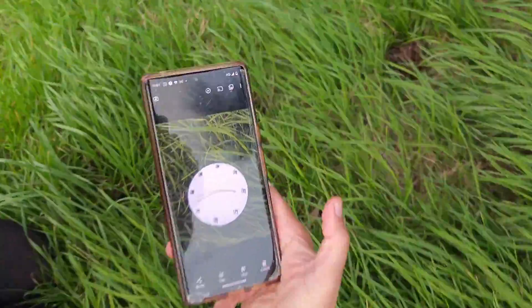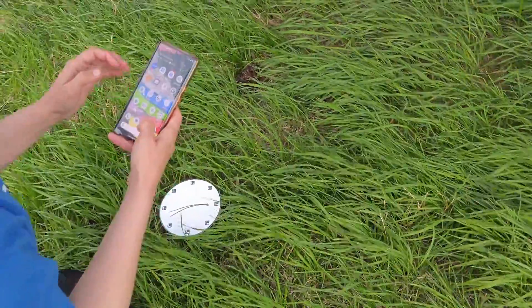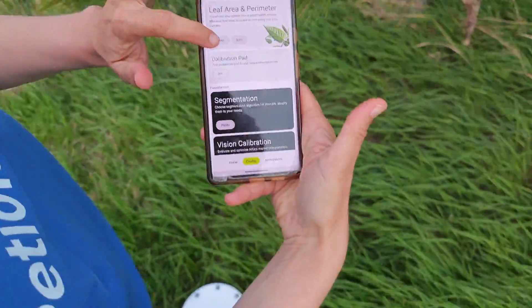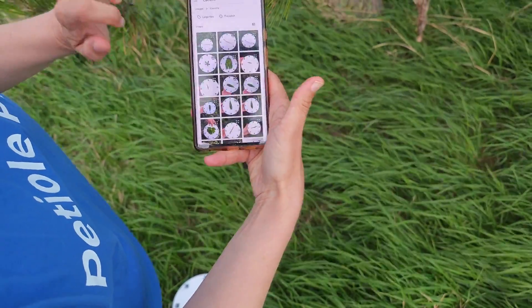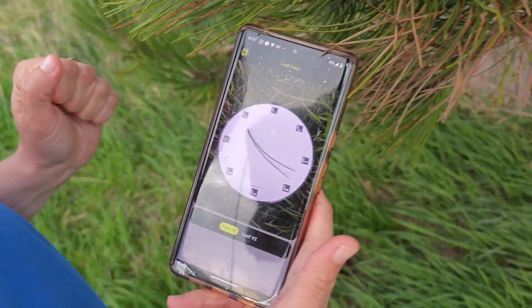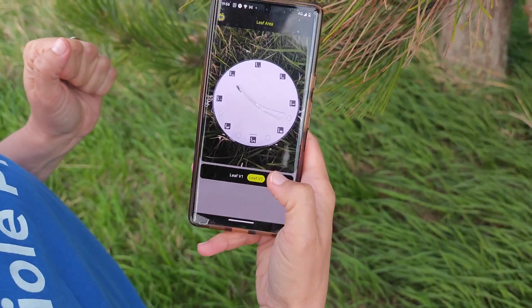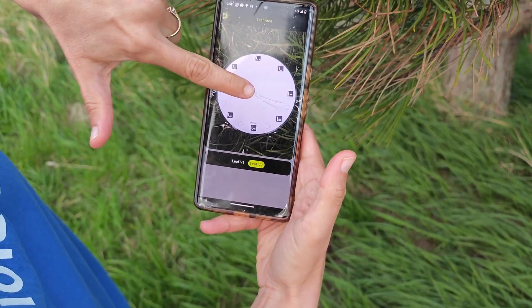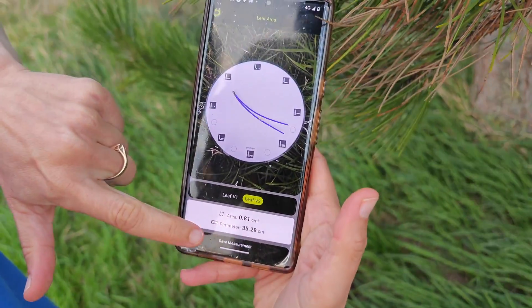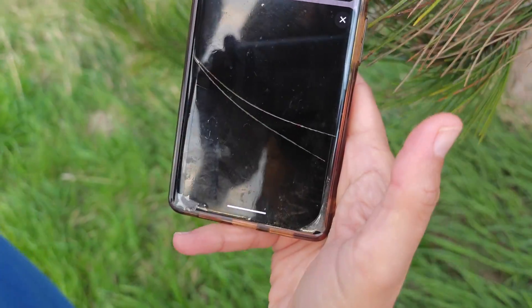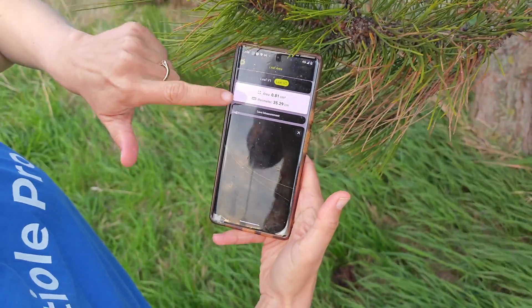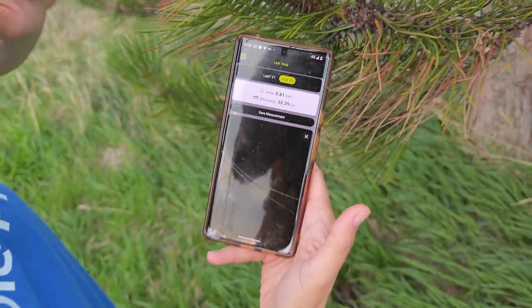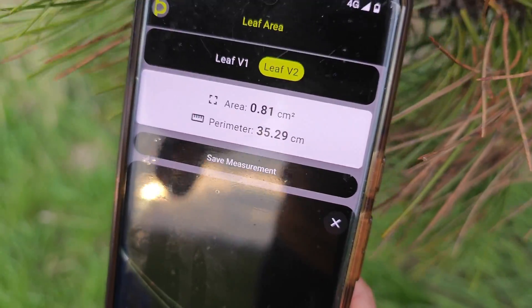Here we have our photo of the leaf. Now let's go back to PTL Pro. Press the photo and choose the leaf. The first algorithm can't detect it, but the second algorithm works well. You can touch the needle and see very good segmentation. The leaf area is 0.81 square centimeters and the perimeter is 35.29 centimeters.